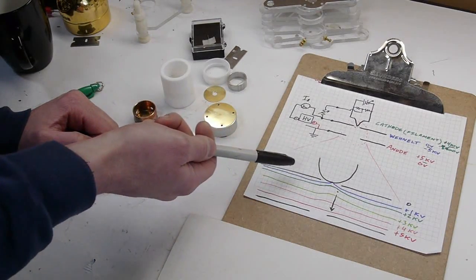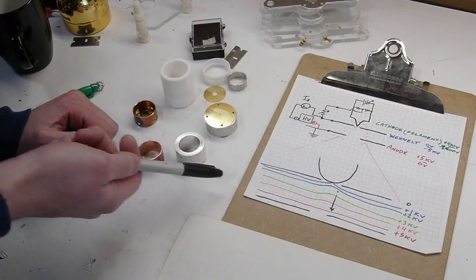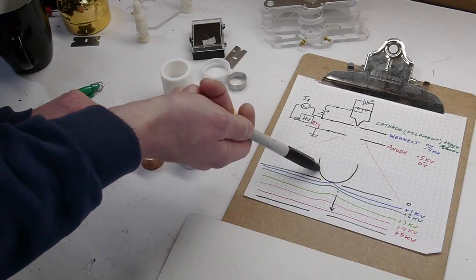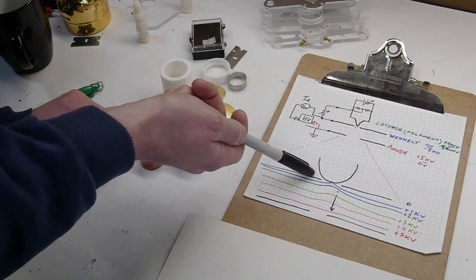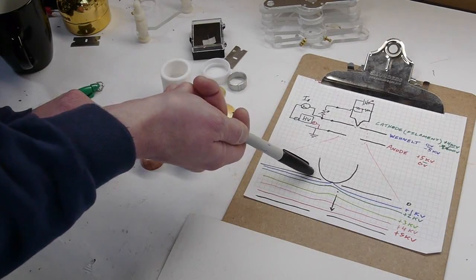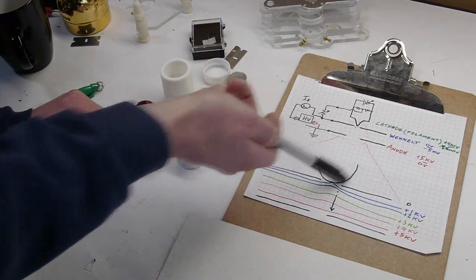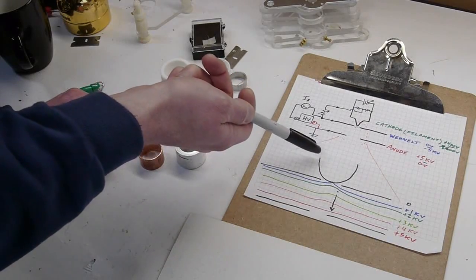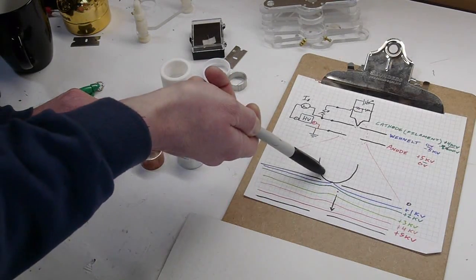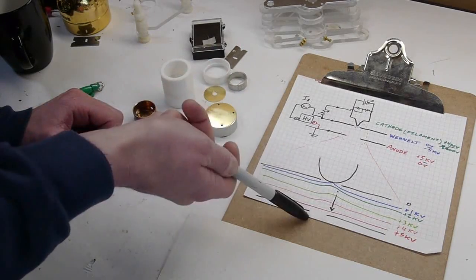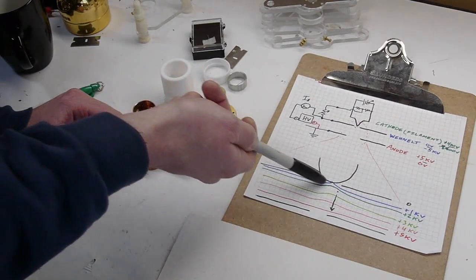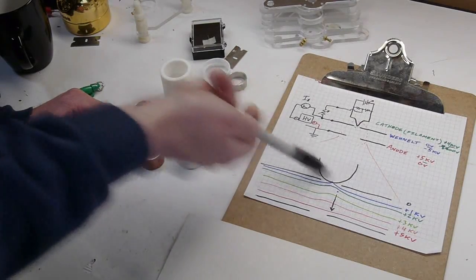So what's going to happen is the filament is going to get very, very positive, even more positive than the anode maybe. Well, it won't get that high, but it's going to shoot up pretty high. And electrons that leave the surface boiled off are going to experience a field that actually causes them to go back to the filament. So if this filament is, let's just say 800 volts, and the Wenelt is zero, any electrons that leave this filament are not going to be accelerated down the column. They're actually going to be pushed back into the filament because the filament is more positive than the Wenelt.